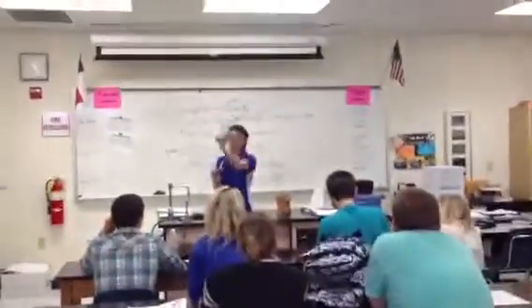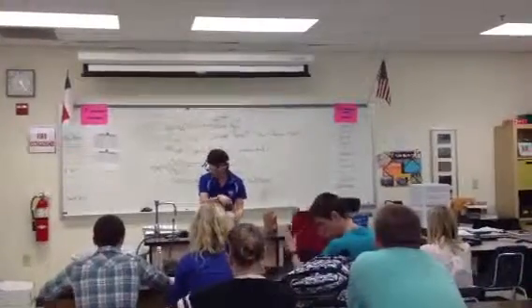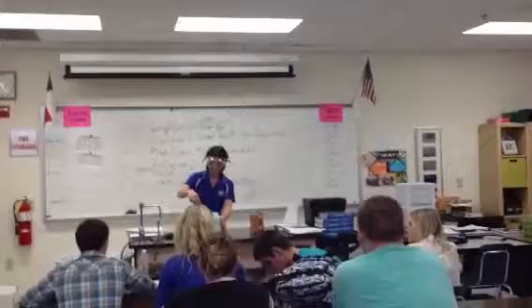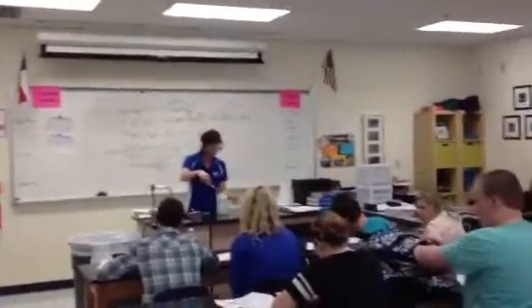To nitrate, you have a place in your data table where you are to make observations of that. So I'm going to get some of that and put it in my test tube. She meant carbonate. Is it carbonate? Yeah, what did I say? Nitrate. I'm sorry, copper 2 carbonate is correct.